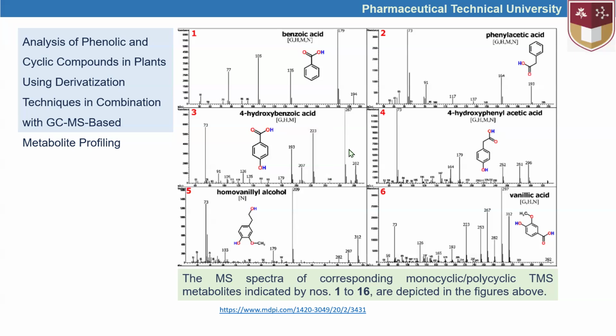Okay, this kind of thing can be found by operating from the database of the GC-MS. So we can find out the molecular masses of one compound, and then we can suggest the structure and the chemical formula of the compounds based on this kind of signals. Therefore, gas chromatographs can be quite effectively used in identification of different compounds.